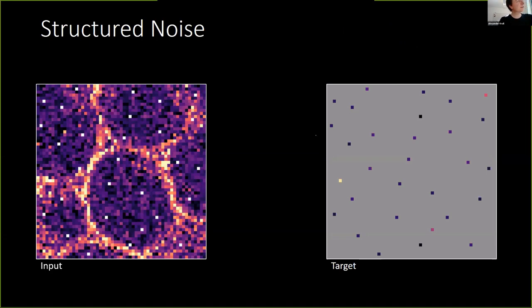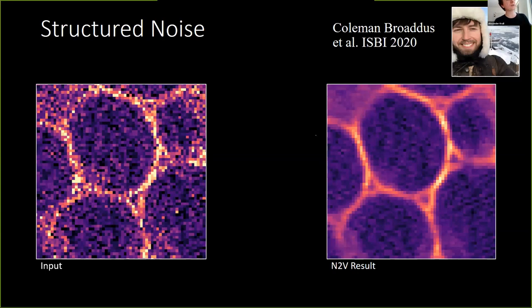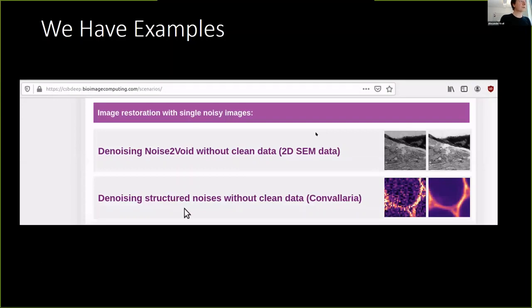In standard Noise2Void, we randomly select pixels and mask them in the input, calculating loss only for those pixels. If the noise is predictable from surroundings — which it is for structured noise — we get bad results. Coleman's solution: instead of masking just the single pixel, also mask a bigger area around it. With this approach you get much improved results for this type of data, as shown in comparison between standard Noise2Void and Structured Noise2Void. Examples are available on the CSBDeep website.